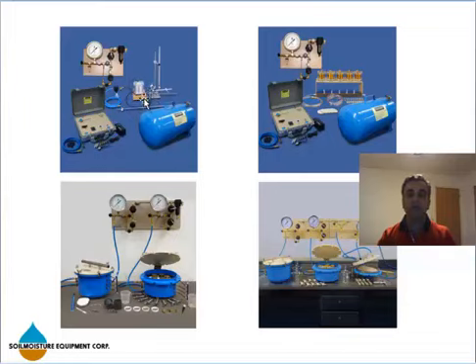I have a better picture in my next slides, but here you basically have a pressure source, an air tank that can be used for pressure and vacuum, a pressure cell, and of course a pressure regulating system, or pressure manifold, that goes from 0 to 5 bar.